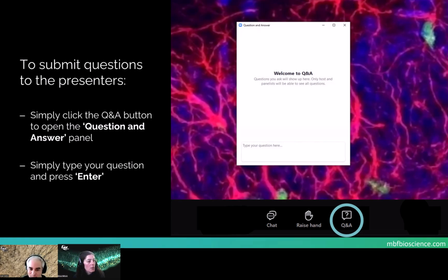Oh, another question came in. Yes, so right now the optical fractionator is the only probe, and that is something that we will be expanding on once we are happy with the number of classifiers that we have. And like I said, we're really focused on the bright field right now. But yes, definitely the nucleator is probably at the top of our list for things to do, just because we're already finding the cell. So finding those edges should be pretty easy, hopefully.